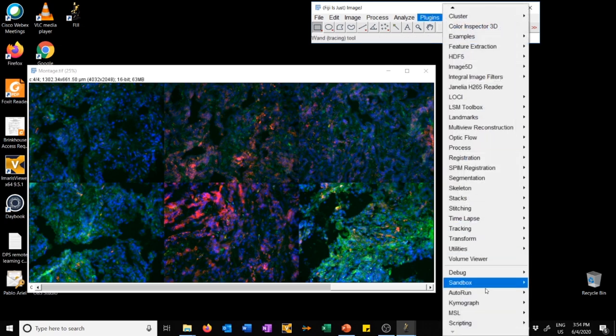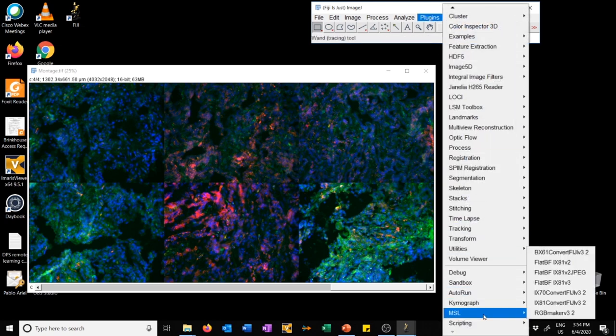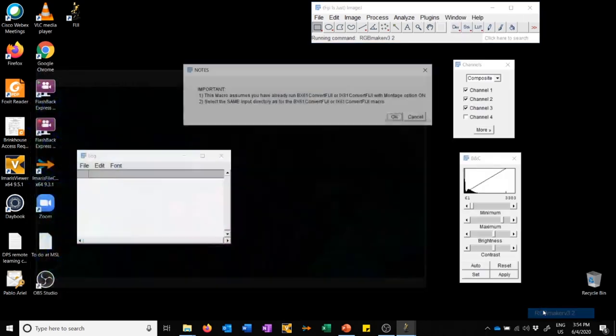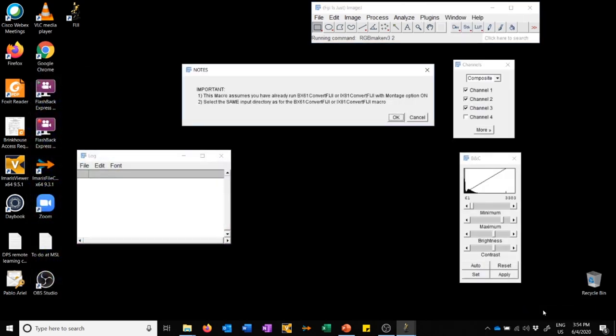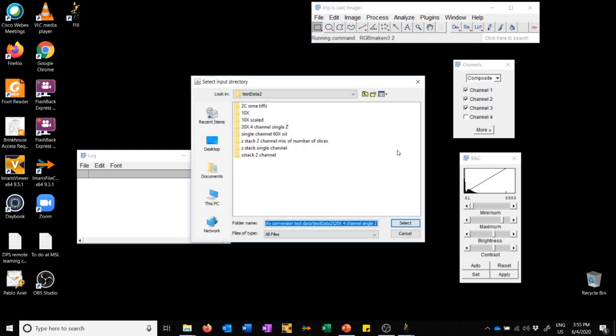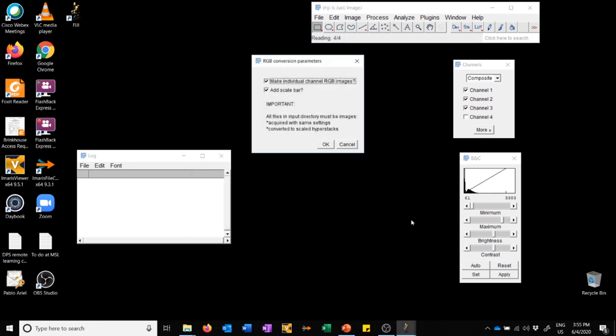Let's run that macro. We go to Plugins, we're now going to go to MSL and run RGB Maker. I'm going to click here. Here there are some notes. This is important: this macro assumes you have already run BX61 Convert or IX81 Convert. Select the same input directory as for the BX61 Convert or IX81 Convert macro. We'll do that. You can see if we haven't fiddled with anything in the Explorer, we are already set in the correct directory, which is this one. So I'm going to say select.